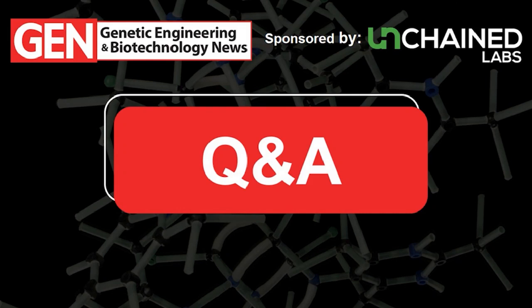Yeah, so I'll take the second part. Do we feel that the partial characterization would become necessary? Correct. Okay. So the current method, the only method right now that can detect partials reliably is going to be analytical ultracentrifugation. But this kind of goes back to my slide, the ultimate QC assay. You kind of want something that could detect all, and we just don't have all of the analytical tools right now. But I do think that looking at partials and just understanding the biology of AAV will become more important as we learn more and more about the impact of manufacturing.